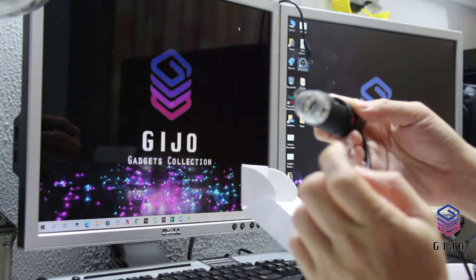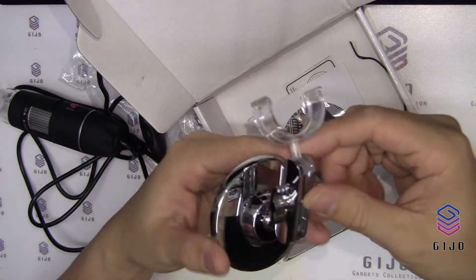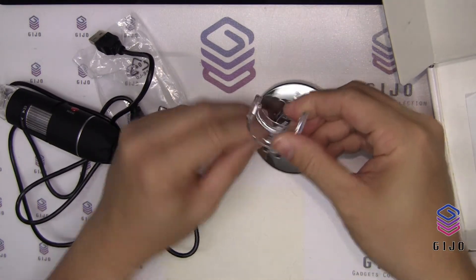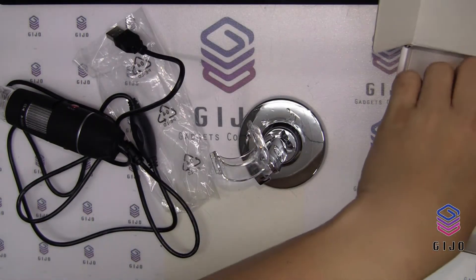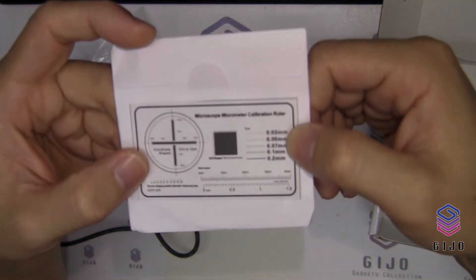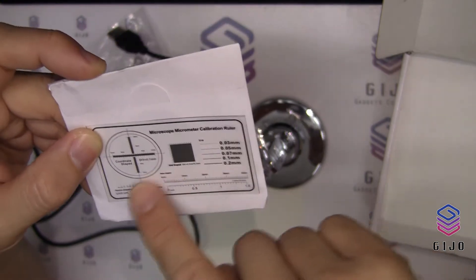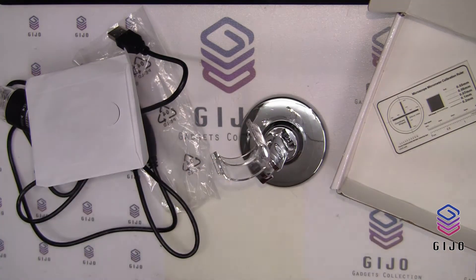It comes with an LED camera as well. And this must be the stand. It came with a chrome color, looks like plastic. And there's a CD here, and also a piece of transparent — it's a micrometer calibration ruler. So I think we need to do some calibration using this, so make sure that you don't lose it. I'm going to install the CD — maybe there's a driver here.